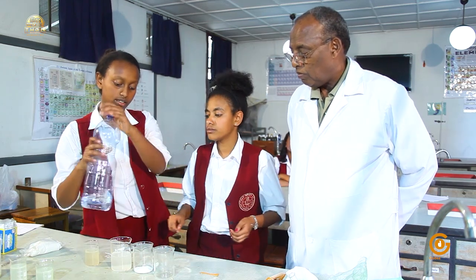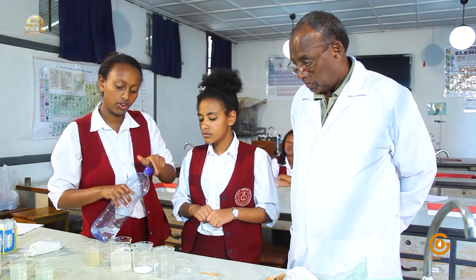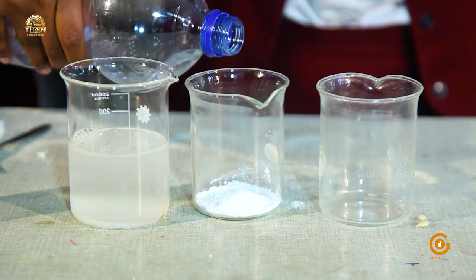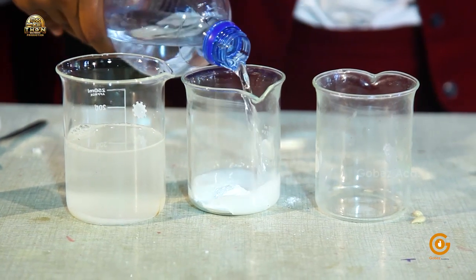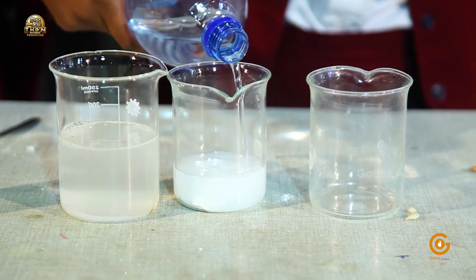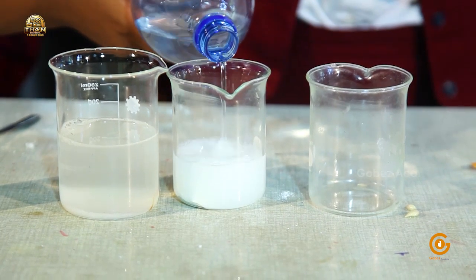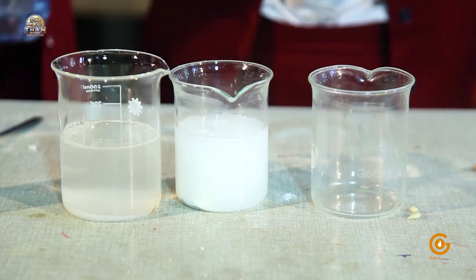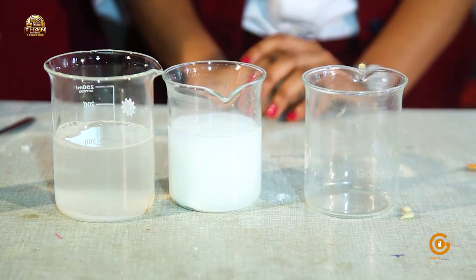So we'll add the same amount of water that we did for the sodium chloride, or the table salt. Okay, that's enough. Now we'll stir.